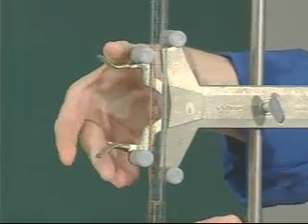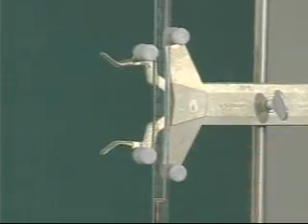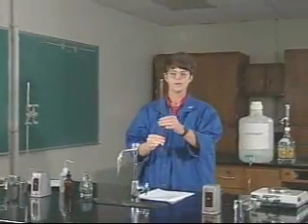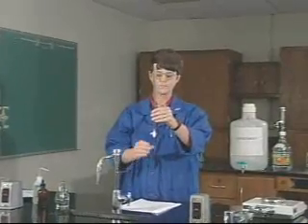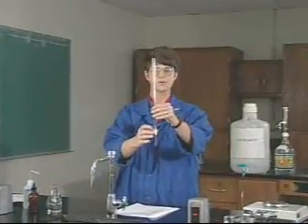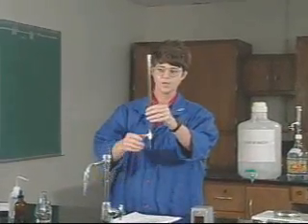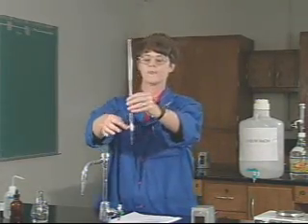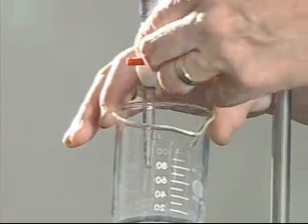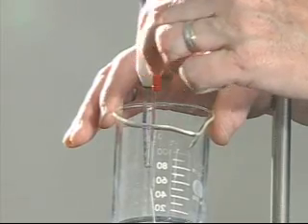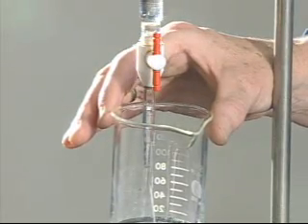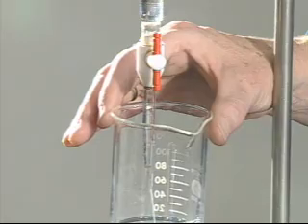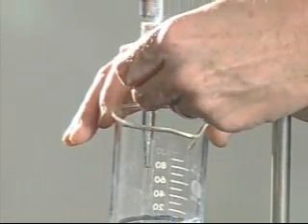I need to talk a little bit about the burette before you begin to use it today. This part is the body of the burette, and this part down here is called a stopcock. This stopcock has a handle on it that can be turned, and if I turn the handle, liquid will flow out. If I turn the handle back so that it is perpendicular to the barrel, then that closes off the flow of liquid.